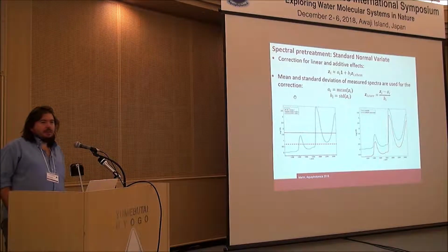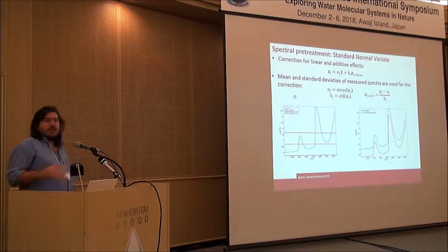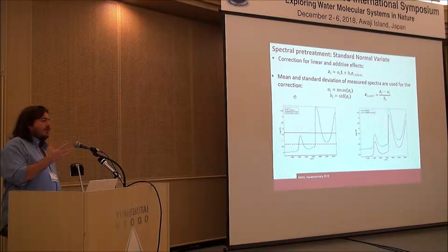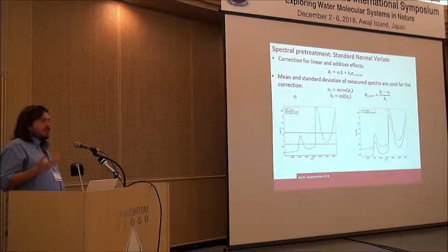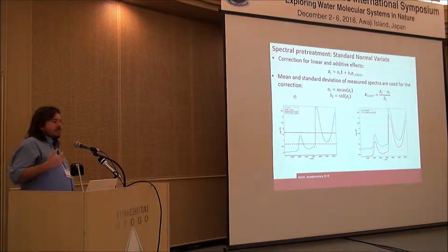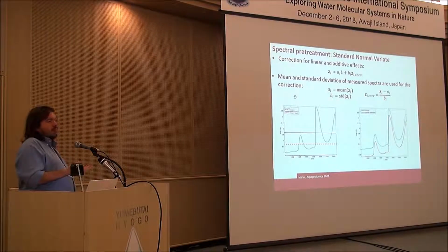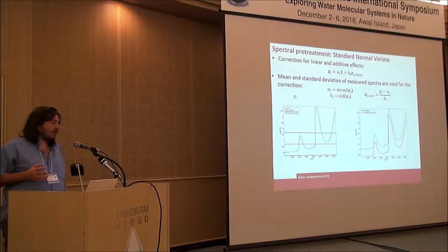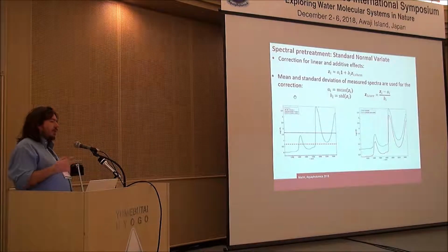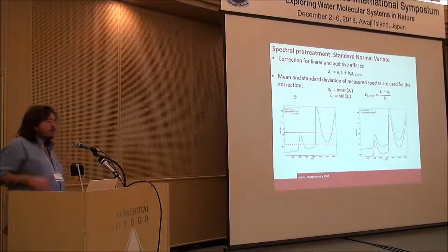Of course, the attention is mostly, for the sake of simplicity, focused on additive and multiplicative effects, because those are the ones that one is more likely to find, especially in the near-infrared or the mid-infrared spectroscopic range, because they are due, or at least may be partly due, to scattering phenomena, but not only to them.